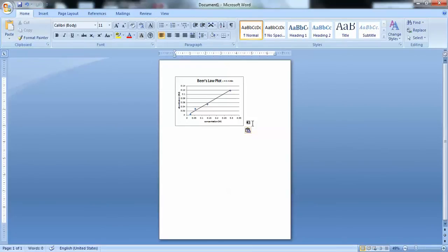Okay. So, this has been a tutorial on how to use Excel to create a scatter plot for the Beer's Law lab.